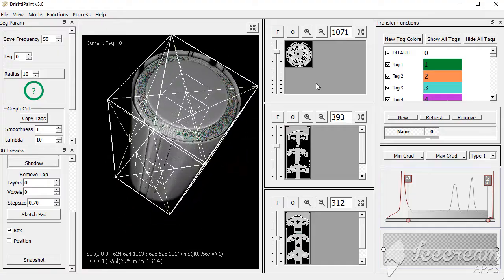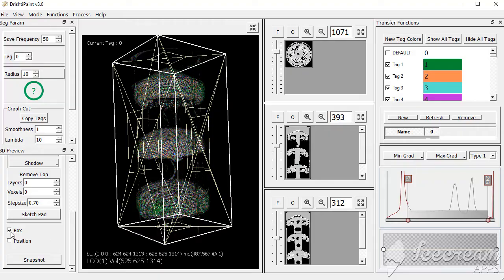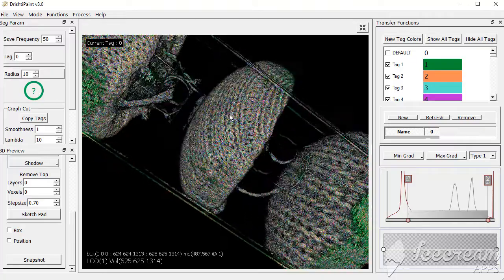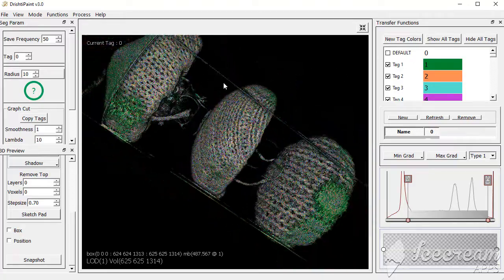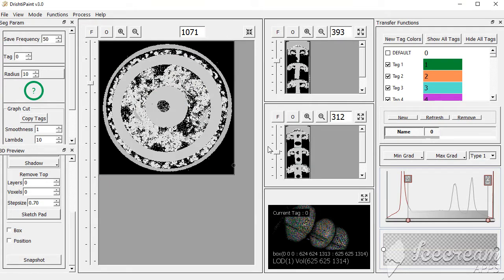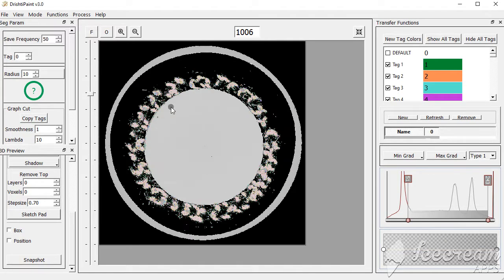It's done that, and now if we turn this thing off, this is what we see here. So these are all basically probabilities; 0 is not shown. So if we go to the slices, the tag value is now the one that is loaded from test.raw. That's what the Python script created.